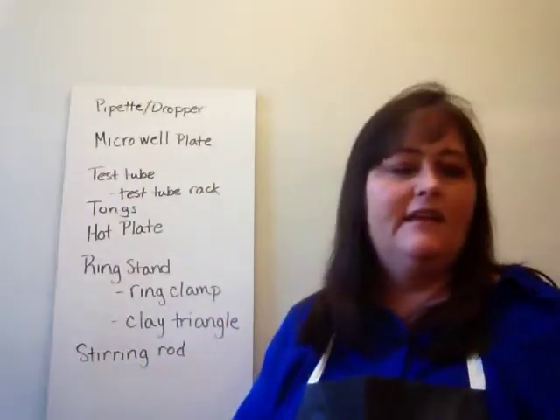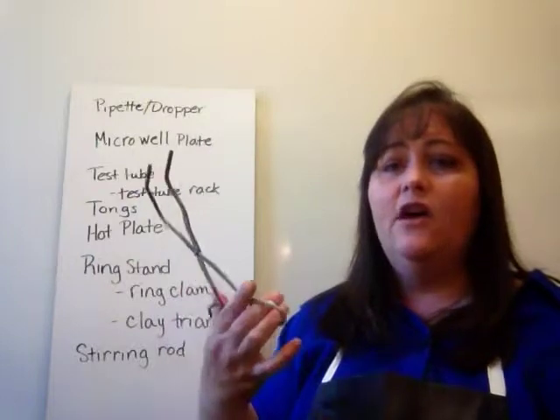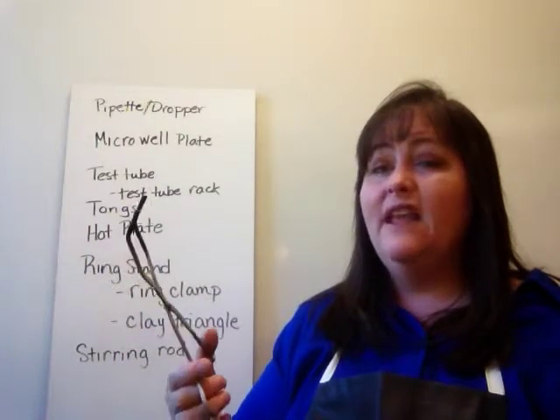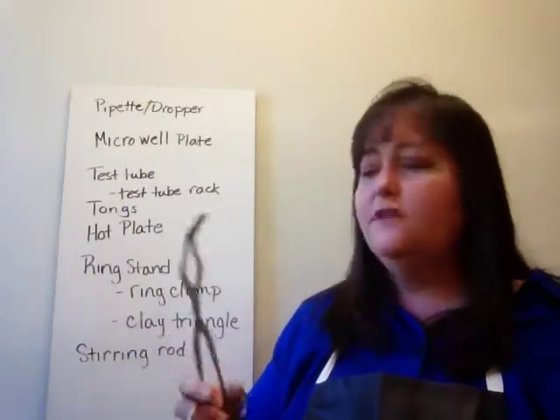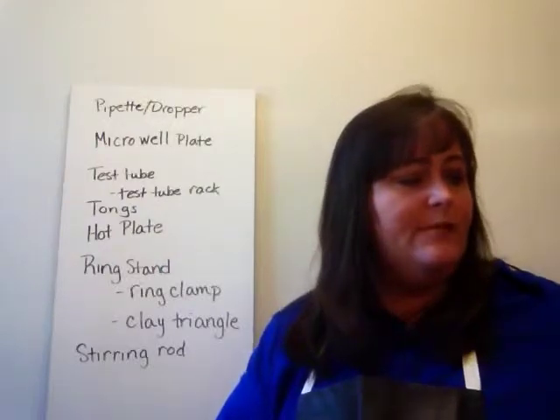The next thing is a piece of equipment that a lot of people think looks like a pair of scissors. It's a pair of tongs. This is used to move hot items from one place to another. It can't be something heavy. It has to be something really small. So we use these from time to time. It's not often that we use them, but we do. And we use them especially when we have used a hot plate.